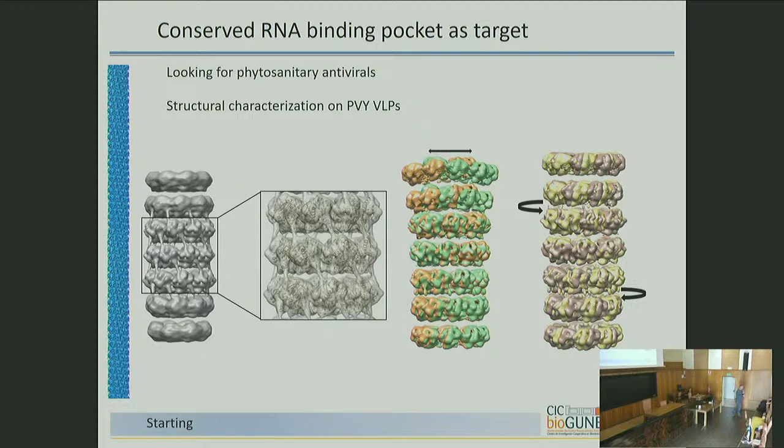They are expressed in E. coli, and you can see here they don't have a real canonical helical arrangement. They have stacked rings of each subunit, and the only interaction is the N-terminal that crosses between turns. Here we have evaluated that despite selecting a straight segment in the micrograph, we still have tilting and relative rotation. We are here at about 5 Angstrom resolution, but this is the evaluation that this can be used to describe the interaction of the nucleoprotein with the compound.